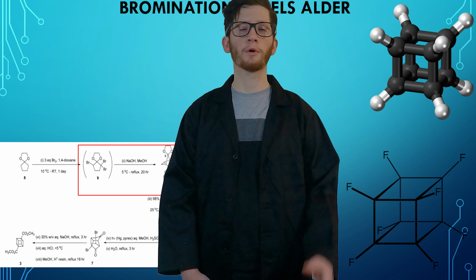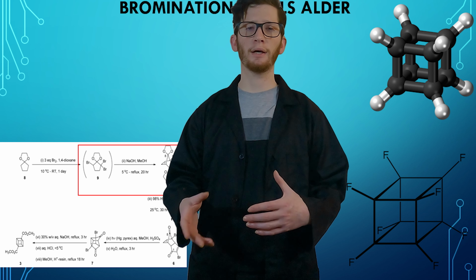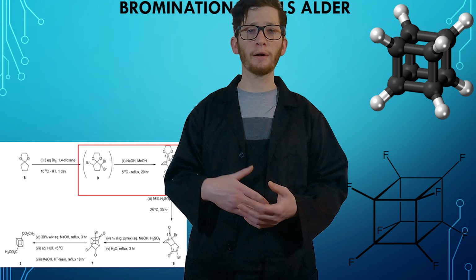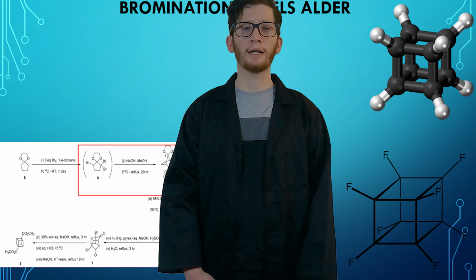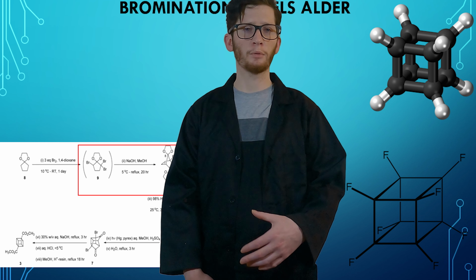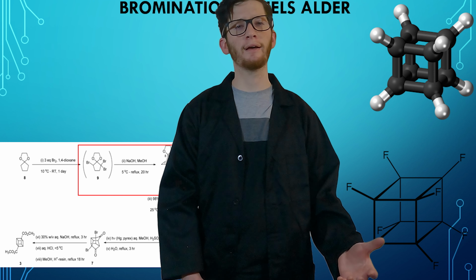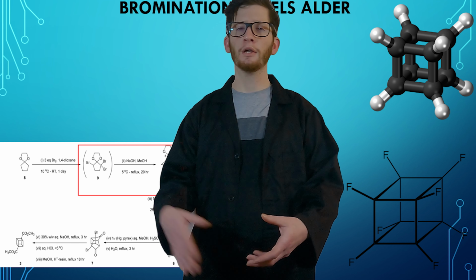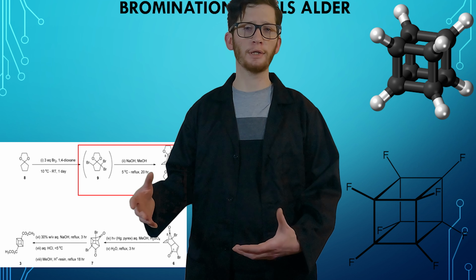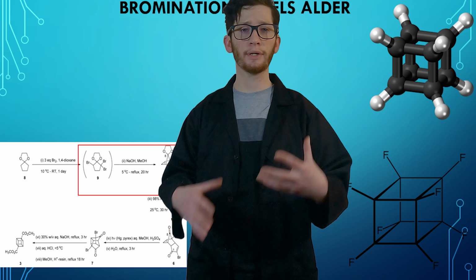In the meantime, I'm gonna work on the photoreactor and continue to get that all set. That's nearly done. I'm just waiting on the 310 nanometer LEDs. They should be here any day. And in the next episode, I likely won't refilm what we've already filmed. I'll probably start in with precipitating out the product, and then we'll go into the next step, which is quite easy. We're gonna do a full deprotection, unlike Tom from Explosions and Fire, who's doing a mono ketal.